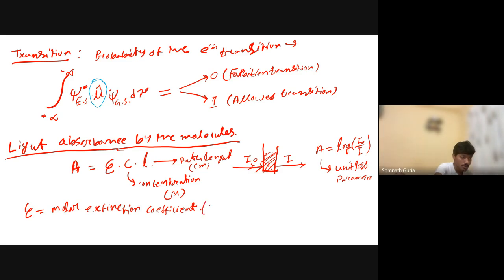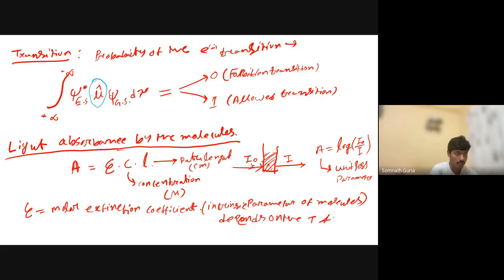It is an intrinsic parameter of molecules. It also depends on the temperature as well as the wavelength of the system.